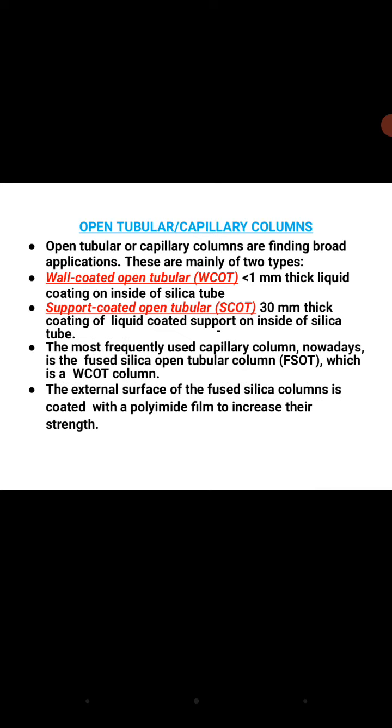The most frequently used capillary column nowadays is the fused silica open tubular column, which is a wall coated open tubular column. The external surface of the fused silica column is coated with a polyimide film to increase its strength.